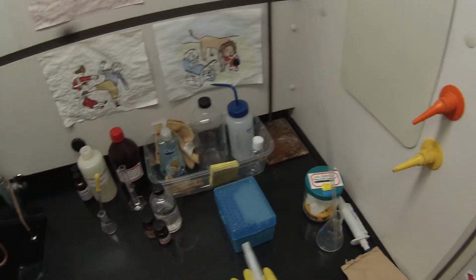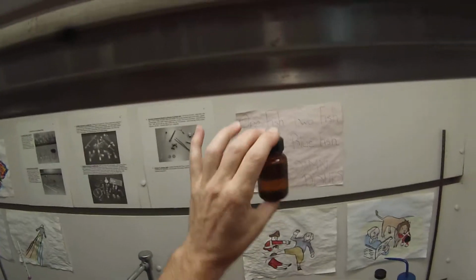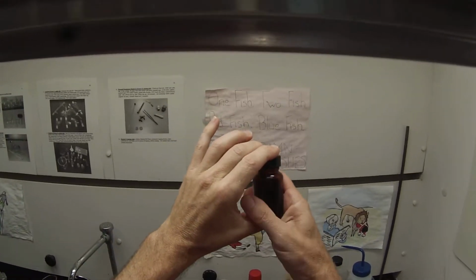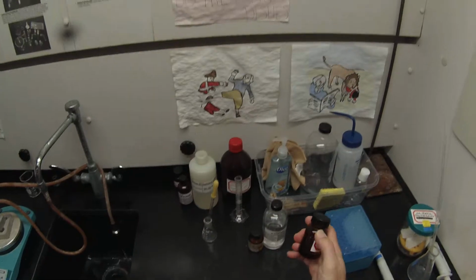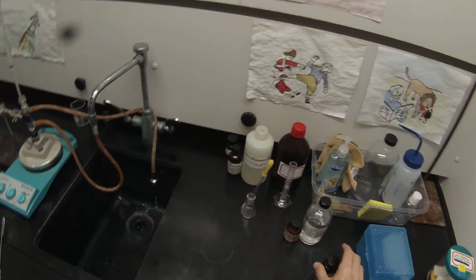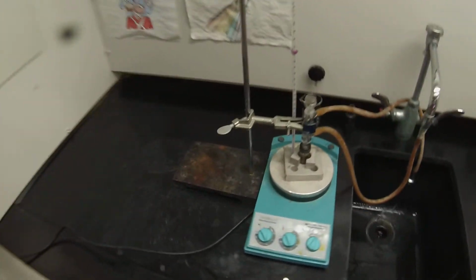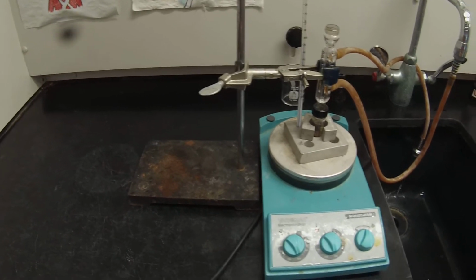when we do the reaction with the t-butyl alcohol. T-butyl alcohol is a solid sometimes at room temperature. Looks like it's warm enough today that that's actually liquid, so we don't have to heat that. Sometimes you have to heat that in a water bath to get it to behave itself. We're up at 70 so far.